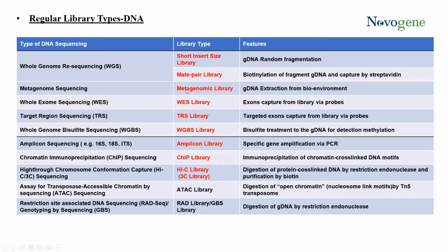So the inclusion of something like phi-X might not be needed. So this is why it's important that we first recognize that there is a difference between samples and library types, and as well within is also important as well. We can have with bisulfite studies, there can be a difference between and across samples that would need individual catering.